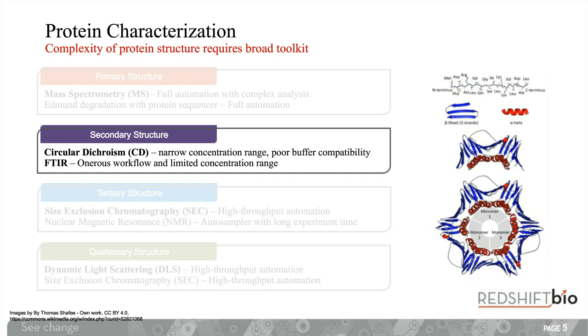Circular dichroism spectroscopy shines circularly polarized light at a sample, right-handed circularly polarized light and left-handed circularly polarized light, and looks at the differential absorption of the two. And this gives you information as to the secondary structures of the proteins within your samples. It's very, very good at giving you information about alpha helical structures and disordered structures, and some information about beta structures, but it's not so good at applying this analysis to the others.